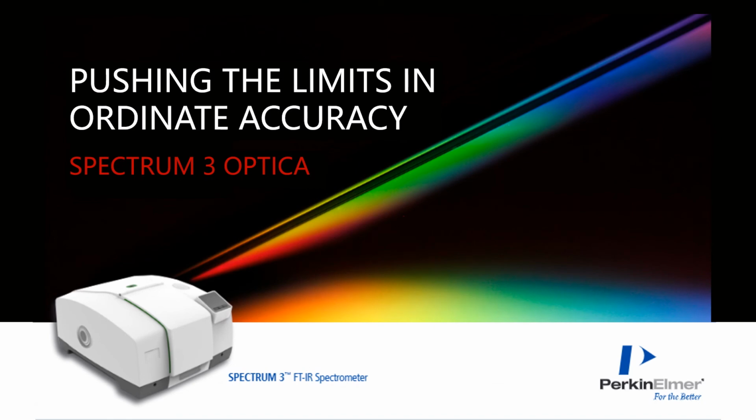The remainder of our discussion will focus on the design benefits which allow the Spectrum 3 Optica to overcome errors that decrease ordinate accuracy. Verification of the FTIR presents a challenge as there is no standard test for FTIR ordinate accuracy in the mid-infrared. Methods to verify instrument performance will be shown by comparing values with transmittance calculated from refractive index values and by comparison to values obtained by NIST.